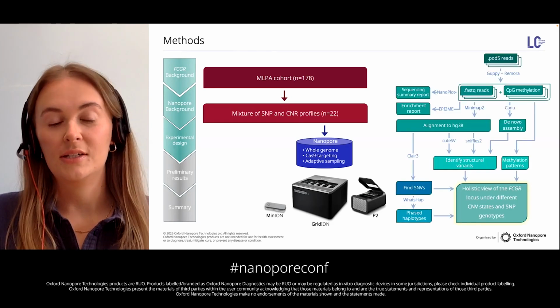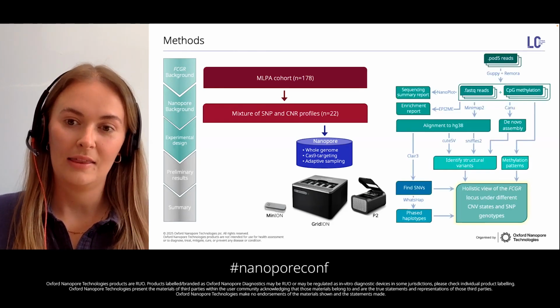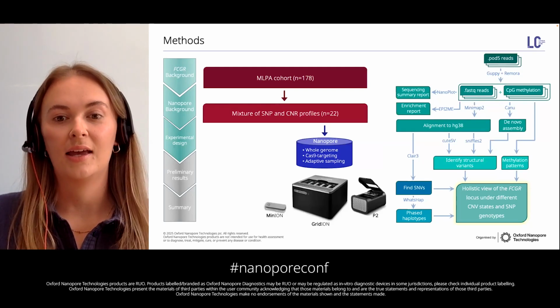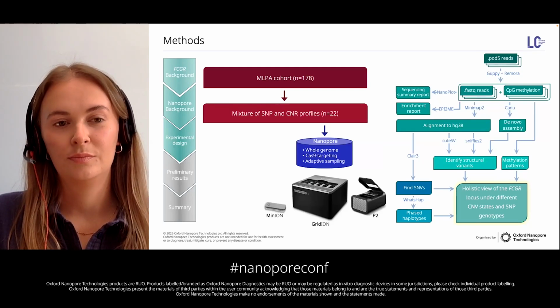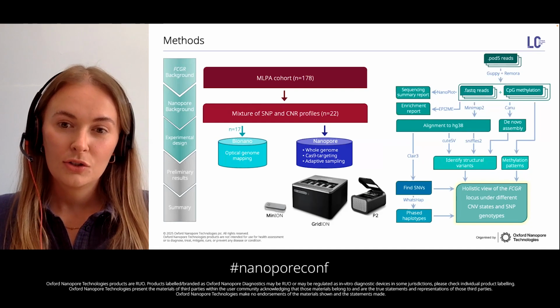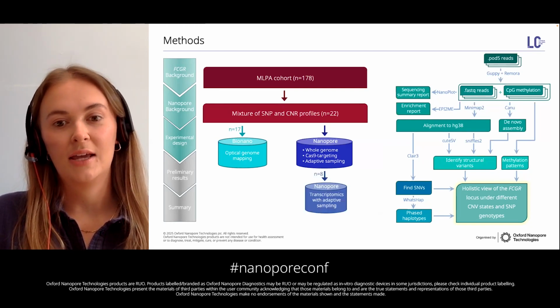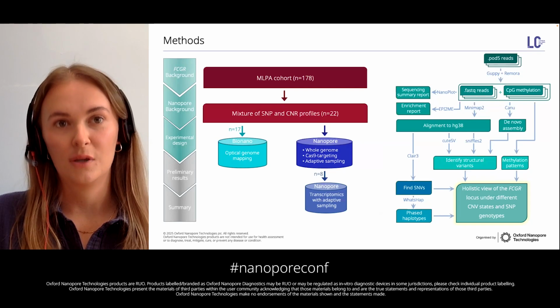Each of these produced a different level of coverage, and ultimately they've complemented each other to enable us to gain information on the phasing, sequence variation, and methylation. The large structural variants were confirmed by nano for the majority of these cases, and we've taken some of these forward for transcriptomic analysis too.